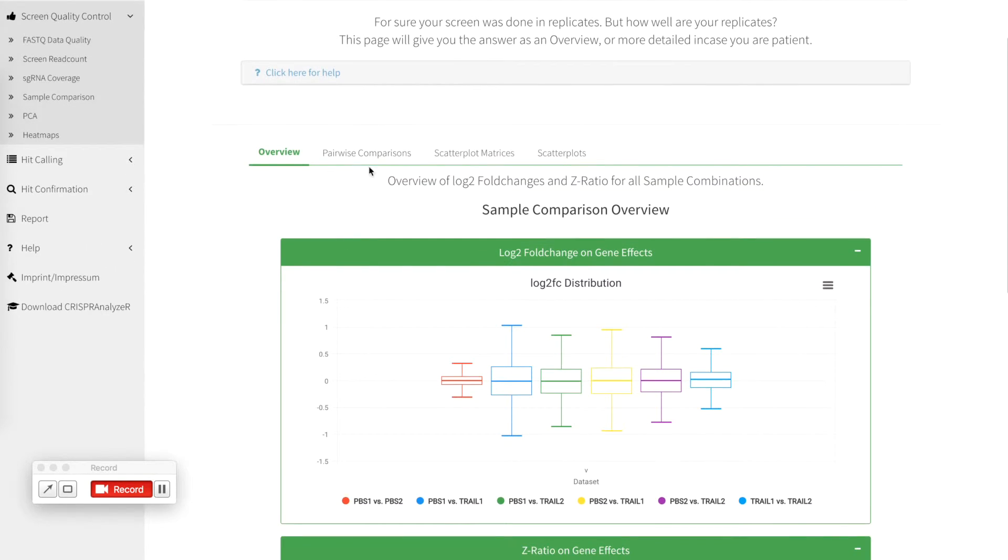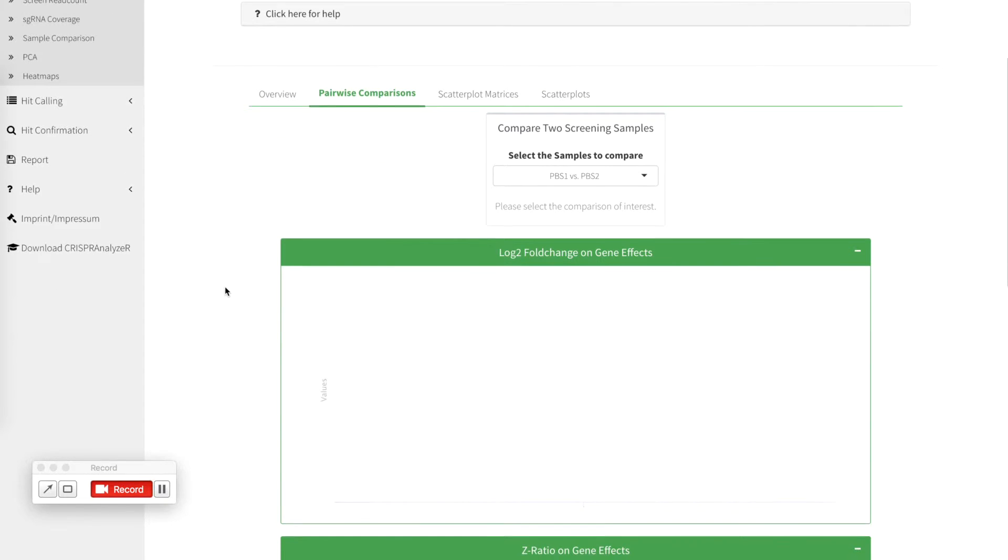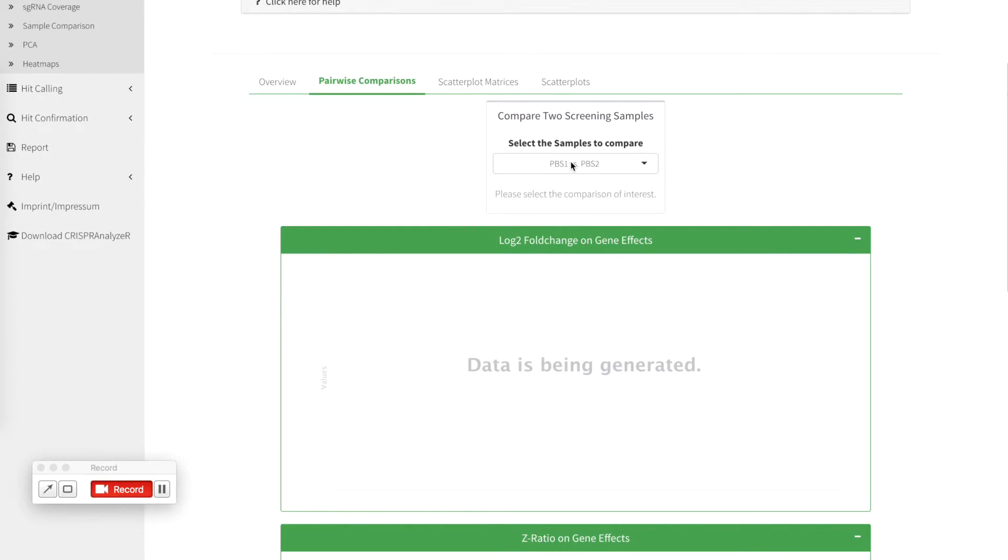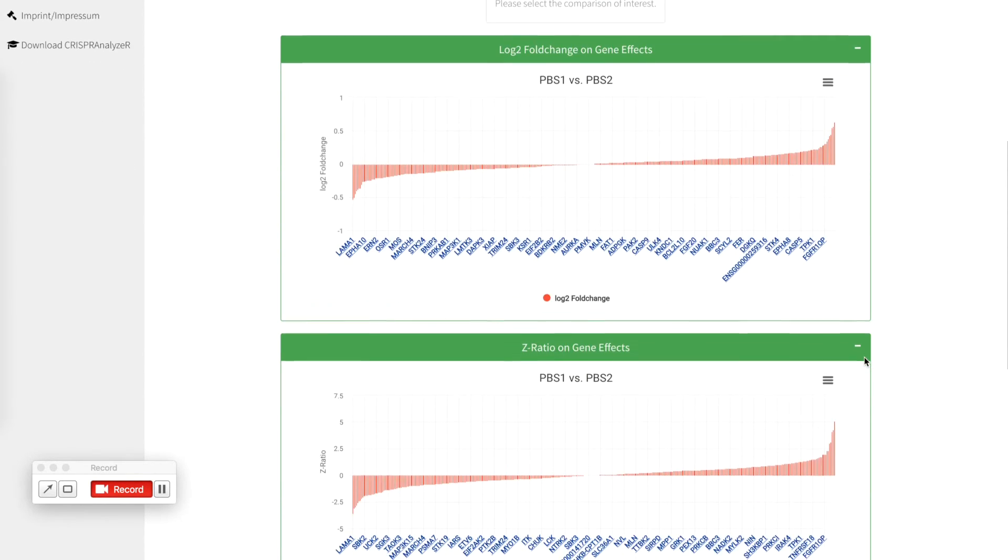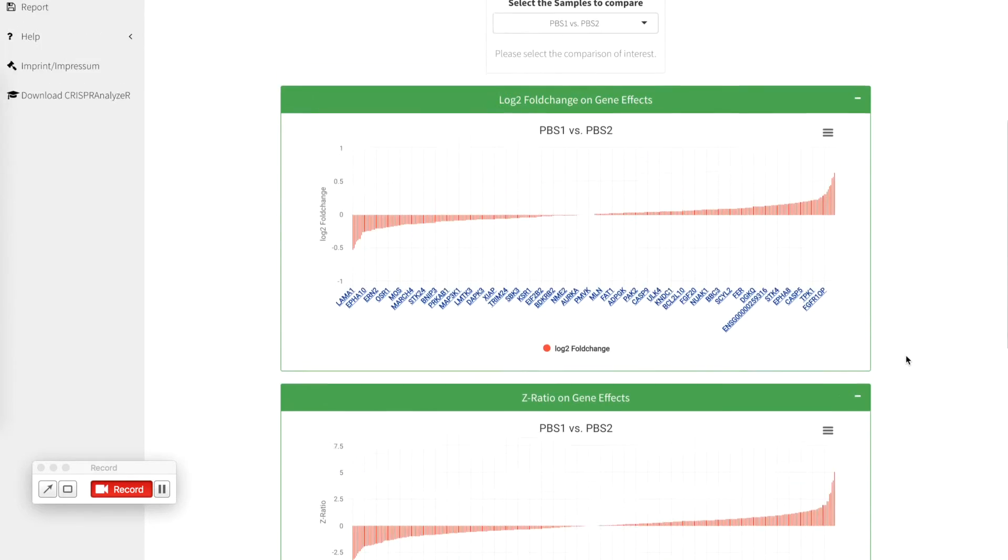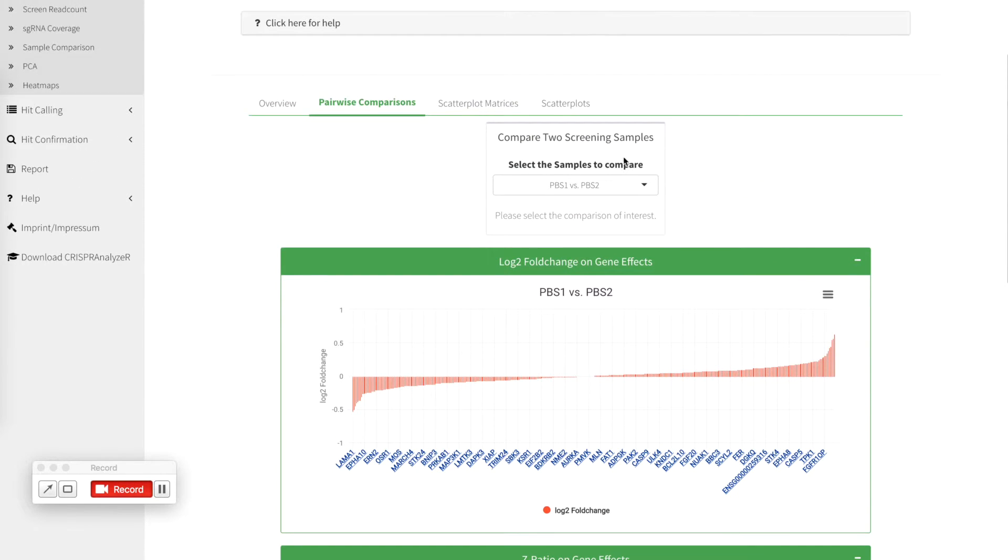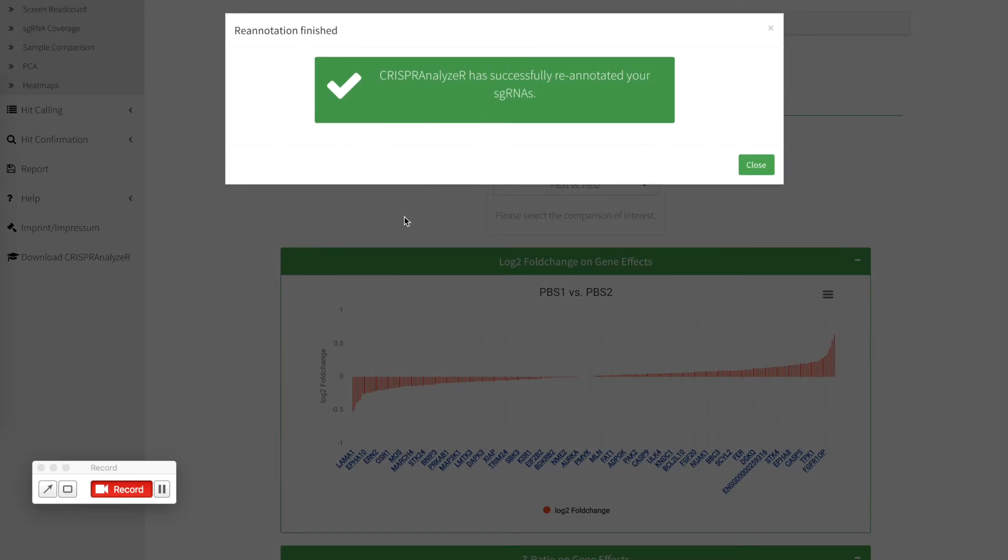You can go on with pairwise comparisons if you like. So this means you can check for different ranking of gene fold changes ratios or sgRNA fold changes between any sample. You can just click here and compare individual sample comparisons.